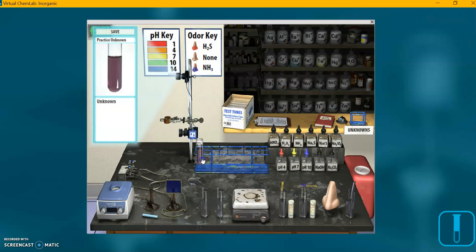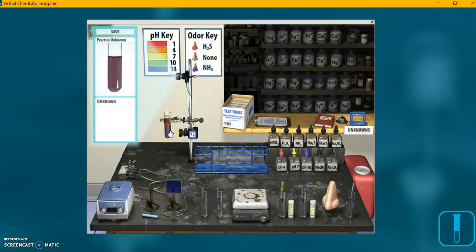I'll drag the practice unknown over to our working area, to our test tube rack. You can see on the zoom screen it says practice unknown. Now if you place your test tube in the working area, you can do all the same kinds of tests that I did earlier. I'm not going to repeat them now, but you can test to check which of those ions are present in your solution.